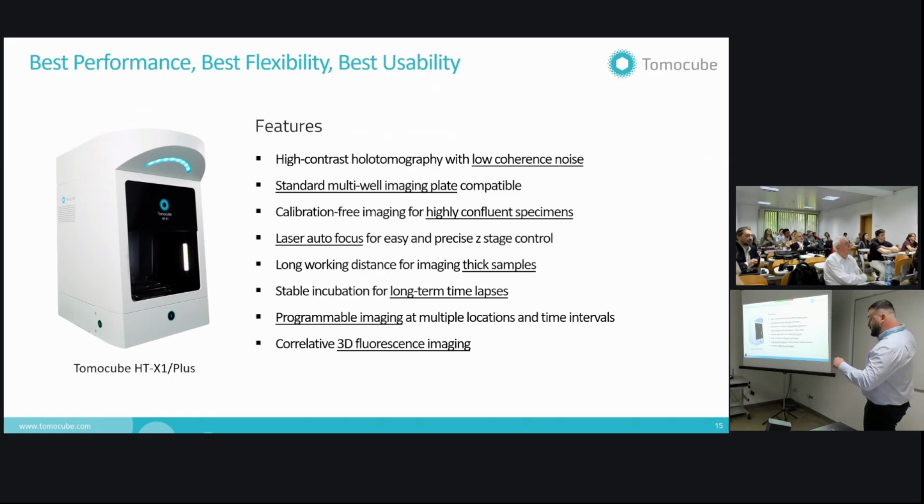Also, because you want to image for a long time, you want to make sure that there's no Z drift. That's why we're using a laser-based infrared autofocus to always scan for the glass. The glass is not going to move anywhere, but the cell might detach. So whenever you use a software autofocus, you're going to have that problem. In our case, we've always been using this S22.